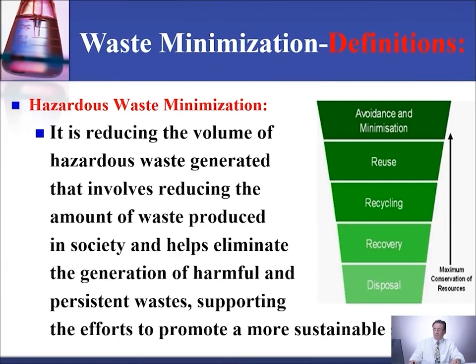Hazardous waste minimization is reducing the volume of hazardous waste generated. It involves reducing the amount of waste produced in society and helps eliminate the generation of harmful and persistent waste, supporting the effort to promote a more sustainable society.